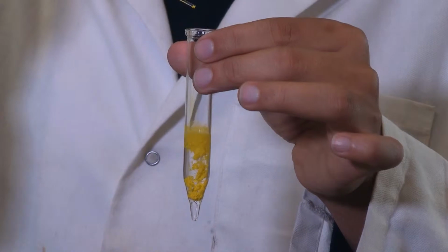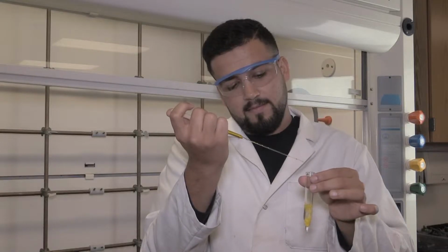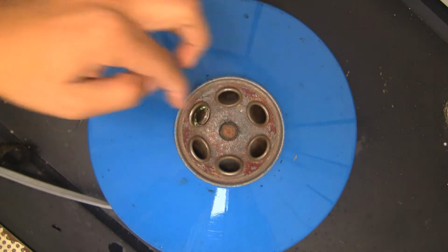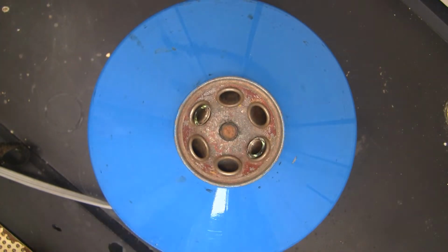In the chemistry laboratory, a centrifuge is used to quickly separate a precipitate from the supernatant solution. Here, Solomon is producing a precipitate upon the reaction between these two solutions. How is he going to separate it? The centrifuge that you will use will likely have some sort of cover on the top. We'll omit the cover for this example.